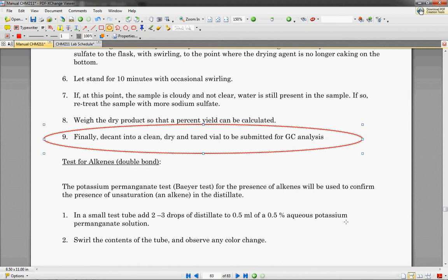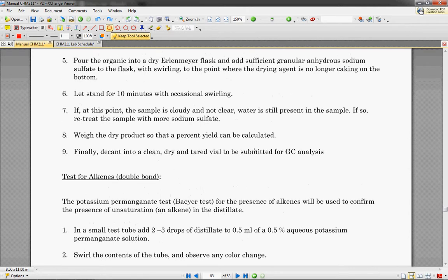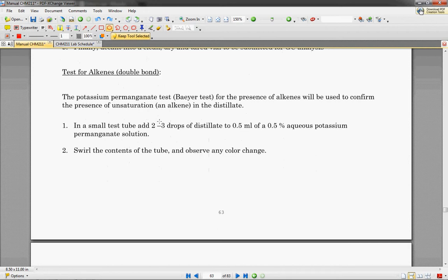Finally, decant it and submit it for GC analysis. We'll give you guys back your analysis, and you can then figure out what you did, what you had, what you got, and compare that to Zaitsev's rule.